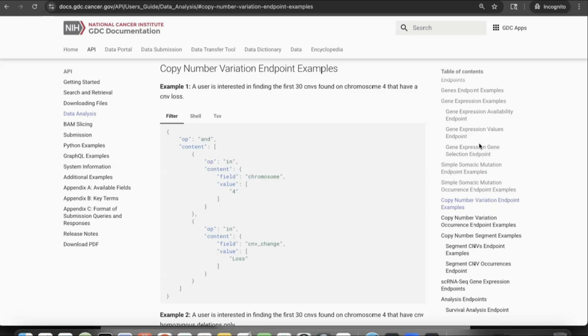All right, thanks, Shin. The second question, and this is in relation to your demo because that's the time stamp that I see. What disease are these seen in? And you can see that from the sample summary by clicking on the sample text label on the left. You'll be able to see that. All right, thanks, Shin.